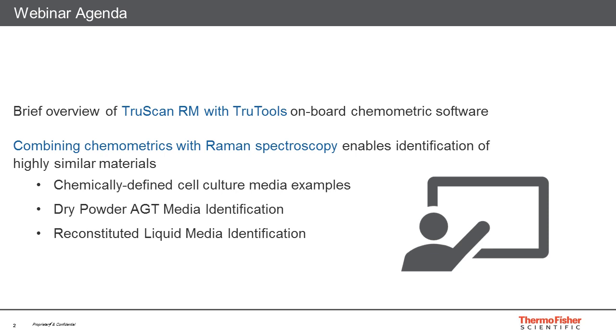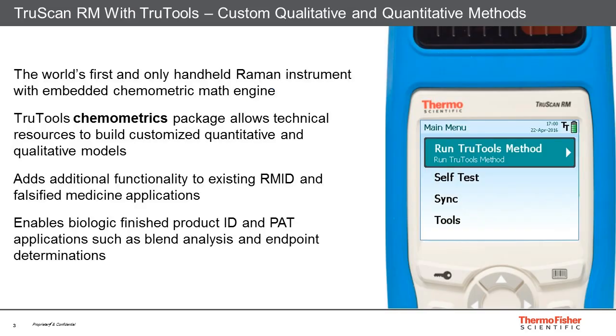With the limited time I have, I'll speak about chemically defined cell culture media and customized algorithms for enhanced material inspection of biologically relevant materials using Raman spectroscopy. I'll also briefly describe our capabilities with identifying reconstituted liquid medias from one another.